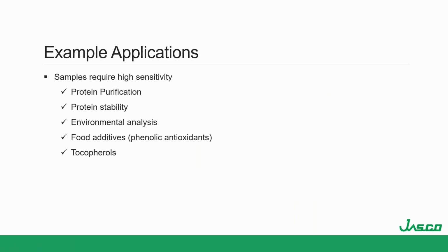So some example applications are samples that require high sensitivity. So there are protein purification, protein stability, environmental analysis, food additives, in particular phenolic antioxidants, or tocopherols.